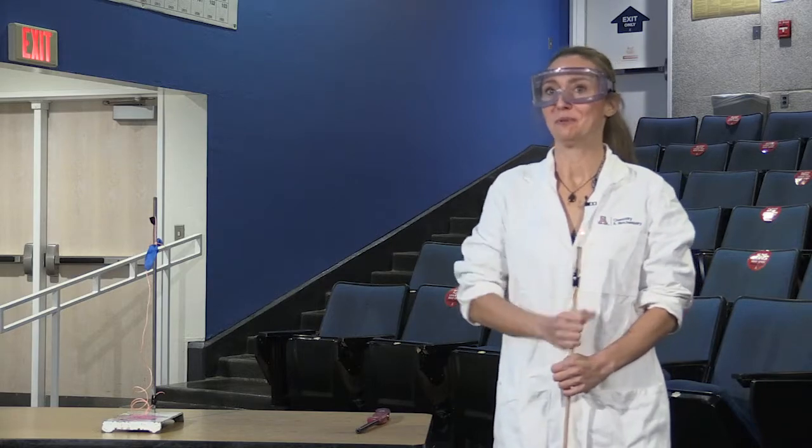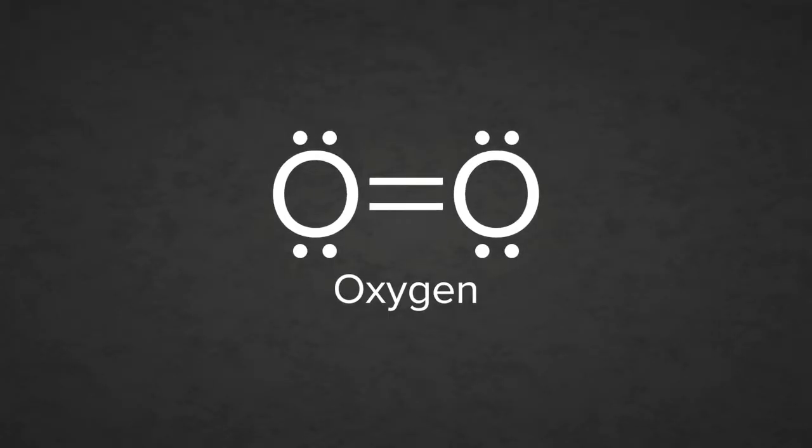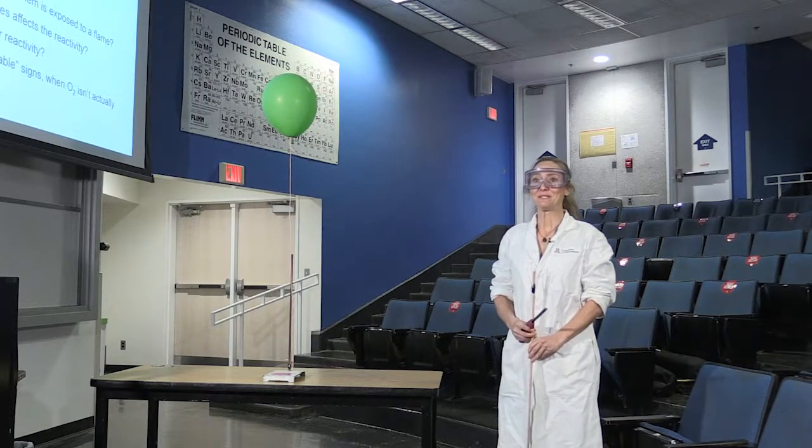Well, that wasn't very exciting, was it? So maybe there's more to the story about why it is that we're warned about the presence of oxygen. Let's investigate that. Also, before we move on to the last balloon, I want you to think about the structure of O2. Remember that O2 has a double bond between it. And yes, that is significant here. It does take quite a bit of energy to actually break that bond. All right, and here's our last balloon.